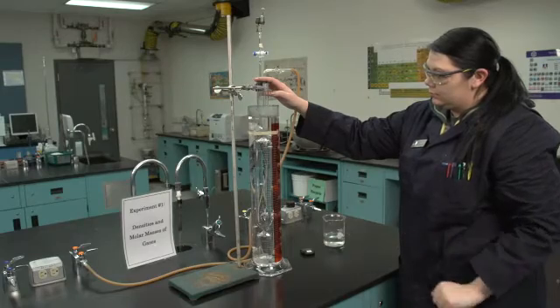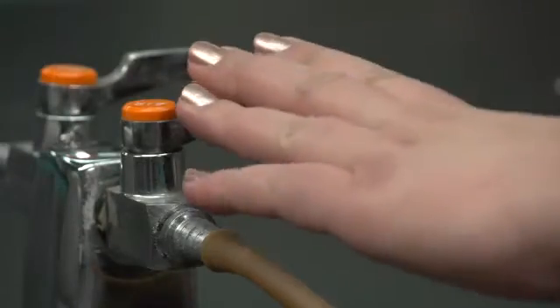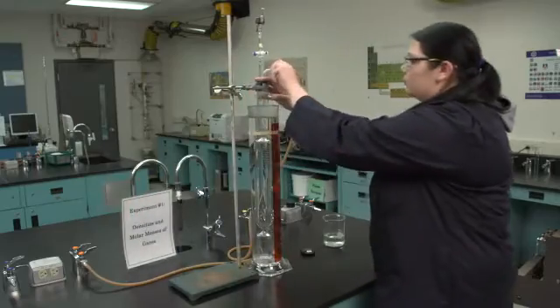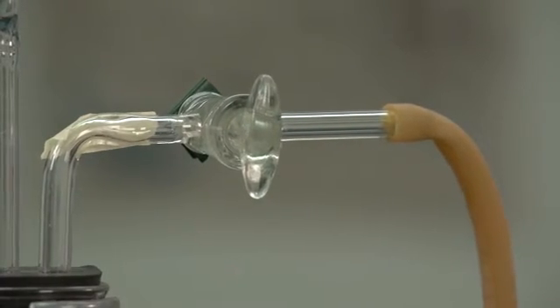Continue to bubble the gas through the apparatus for one minute. Switch off the gas and immediately close the stopcock associated with the inlet gas. You can take your hand off the stopper at this point.